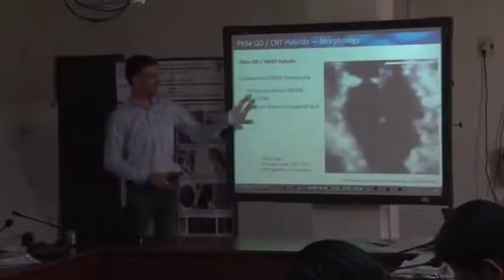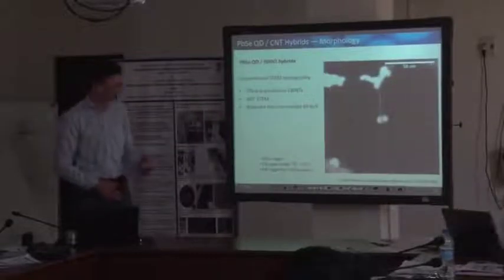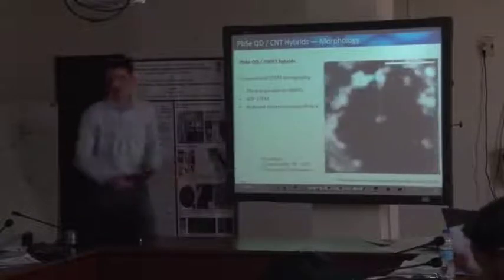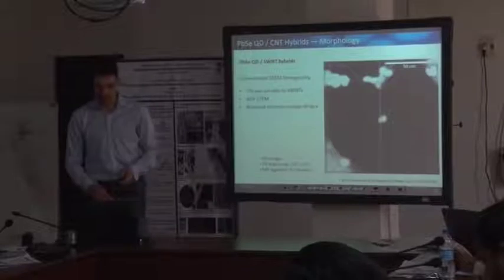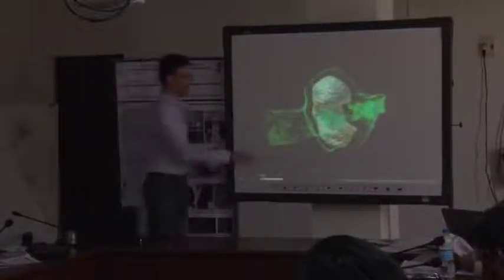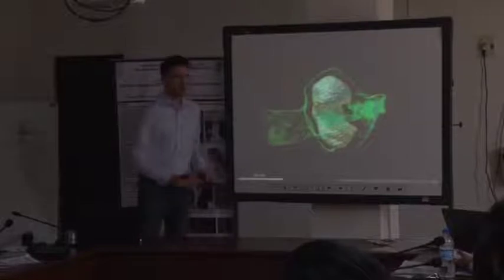There are again some fluctuations because we are in ADF mode. The tilt angle range here was between plus and minus 70 degrees. So we have to expect a certain missing wedge artifact. But in principle, this is a reconstruction with some contamination around after the reconstruction already, showing how the shape or the morphology of such a particle looks like.